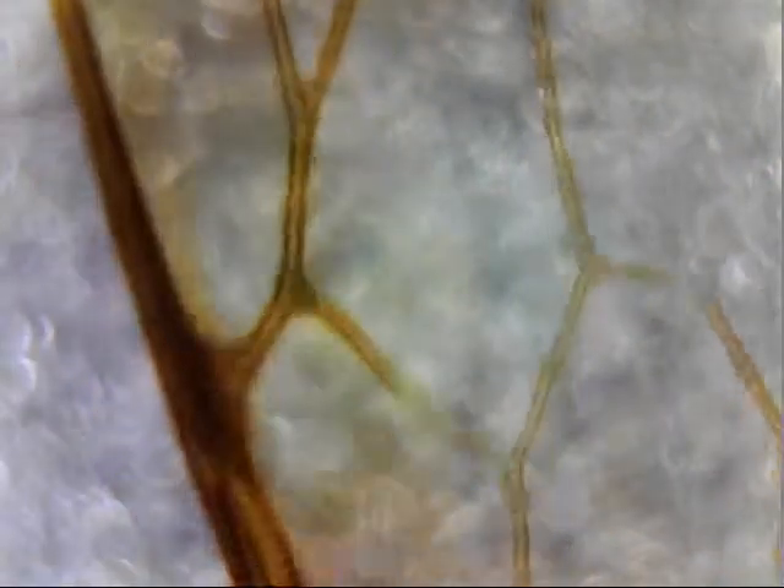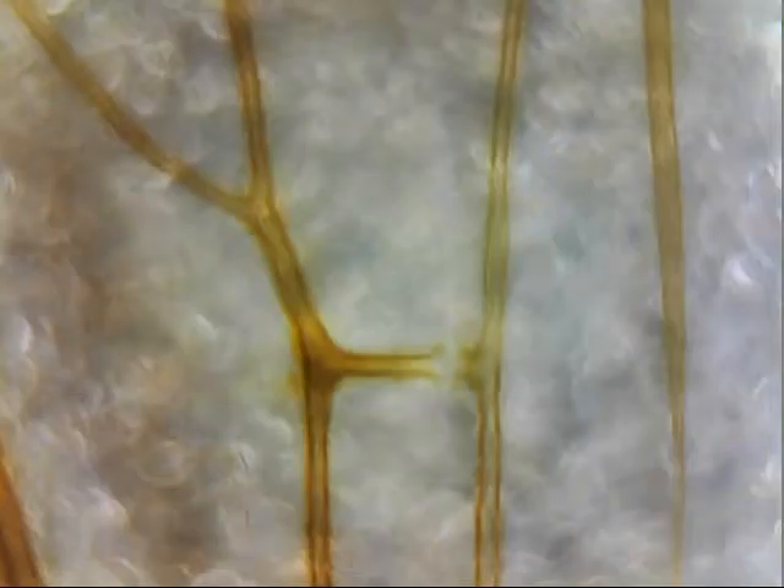It's interesting to get the various different parts separated, because you can look at a bee and look at the entire thing. But when you get to look at just a wing, you can really focus on it and get the details, because when you look at an entire bee it's very three-dimensional and everything's going to be crumpled up or kind of falling apart. But with just a single part, you can get some more detail there.